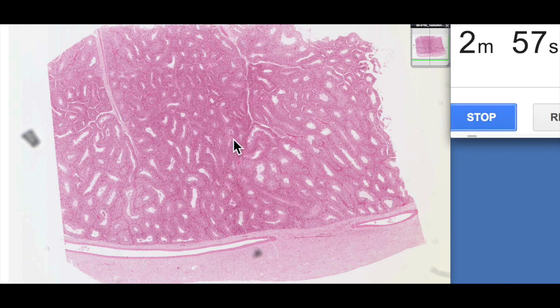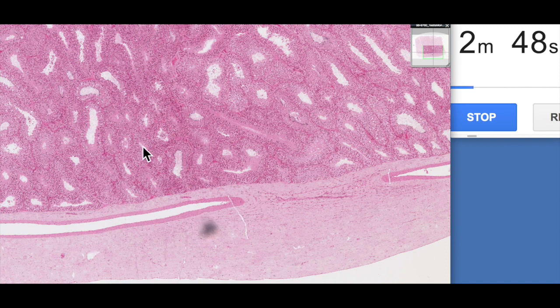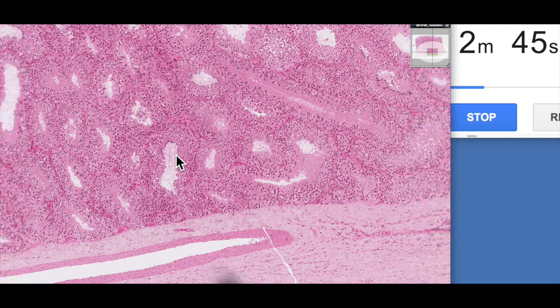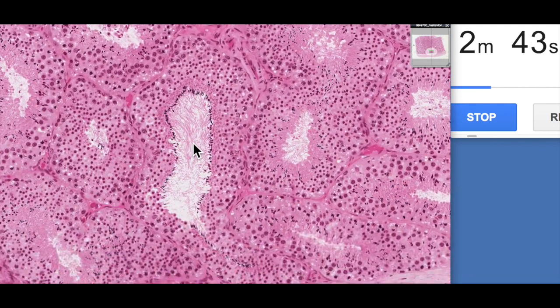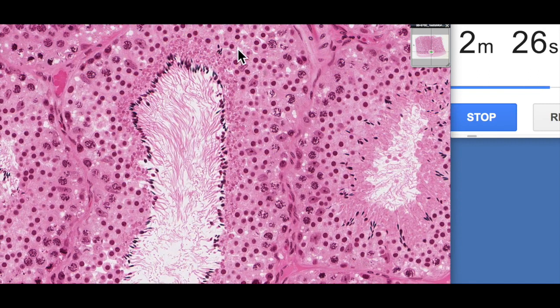This is a section of the testis. We've got the tunica albuginea out here — this dense connective tissue. Here we've got the tunica vasculosa; you can see the big blood vessel here. And then we've got all of our seminiferous tubules. If we zoom in, you'll see what I was talking about regarding the quality of the cells. Look at all those nuclei, really standing out nice and clearly. The seminiferous tubules are bounded by these layers of myoid cells, which you can see quite clearly here.